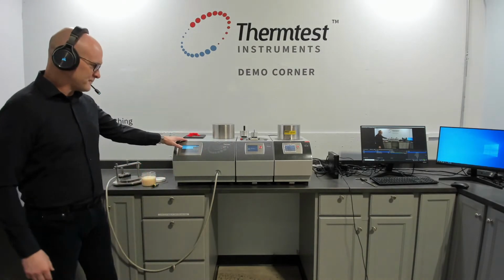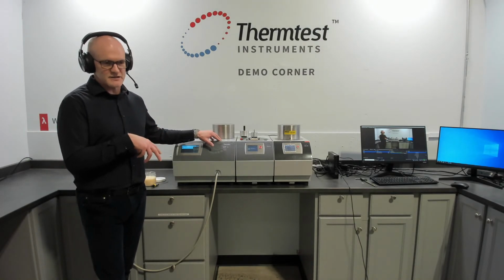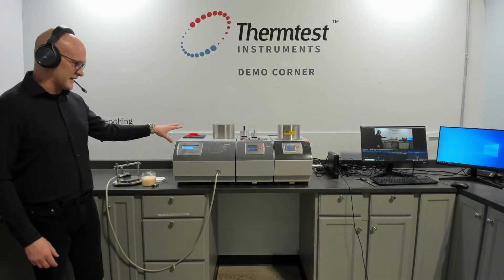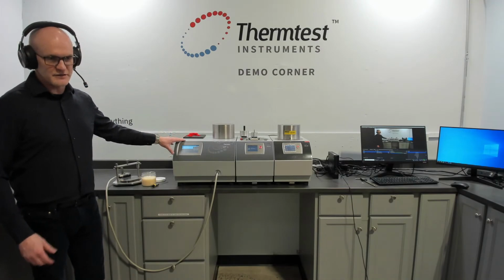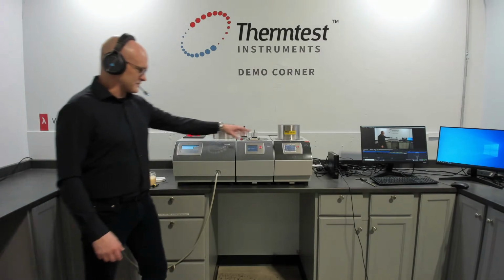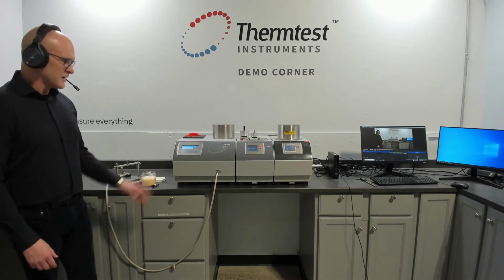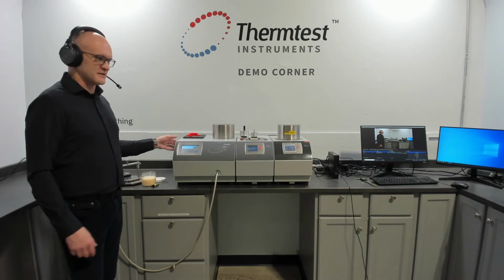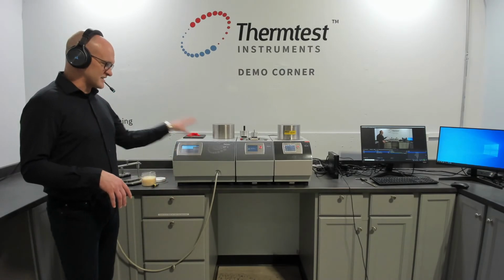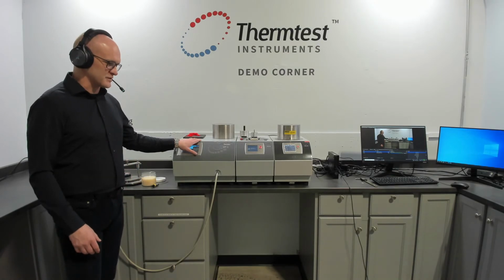So this is our MP-1. This is what we'll be doing the sample setup and testing on for measuring polymers from the melt today. This is our advanced thermal conductivity, thermal diffusivity, specific heat instrument covering several methods. The sample setup today is 2 transient plane source temperature platforms, which we'll talk a little bit about. This is what we describe as future-proofing your needs, as it really has a wide, diverse range of methods and technology specifically designed to cover the widest range of applications possible.